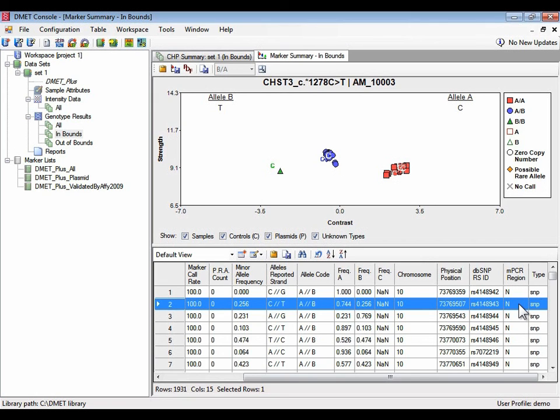So there are certain regions on the chromosome that we do multiplex PCR on to amplify certain regions. And the purpose of this is to make sure that when we genotype regions that have similar sequence homology to other regions on the genome, we only want to genotype a particular location on the genome. So what we do is preferentially amplify that region to make sure that the assay will preferentially measure that region.